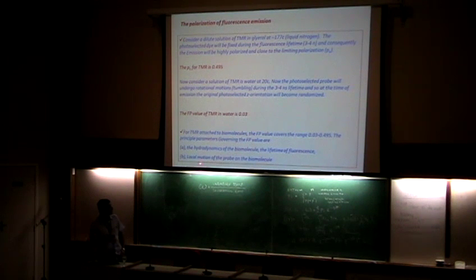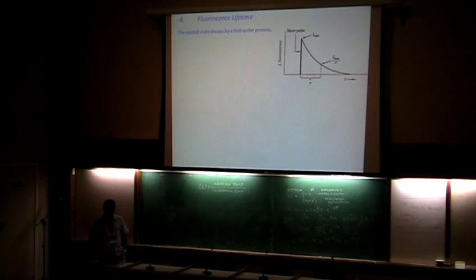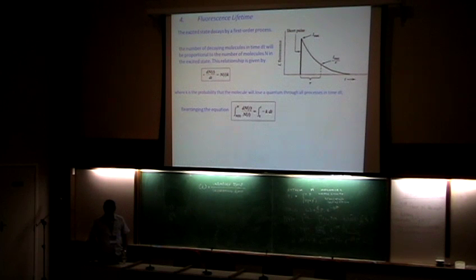applications. Of course, you always have local motion too, so ideally, in addition to measuring at steady state conditions, it is sometimes important to do dynamic measurements during the decay of the polarized state, and that can be done too. And now fluorescence lifetime also; we will not go through all the technicalities of the measurement, but it's quite important, and a little further on we'll show some examples, that it's important to measure lifetimes.